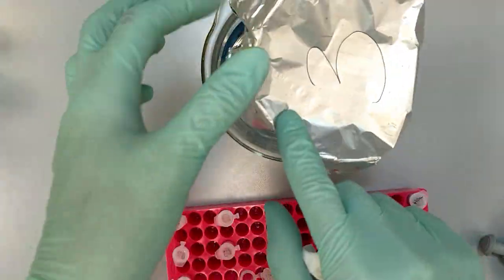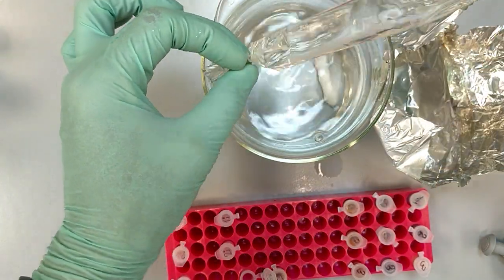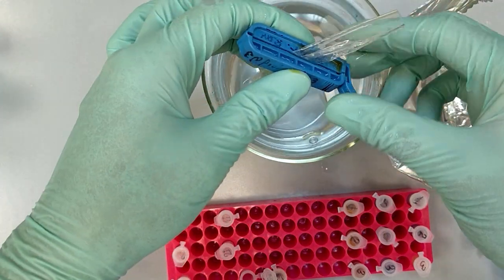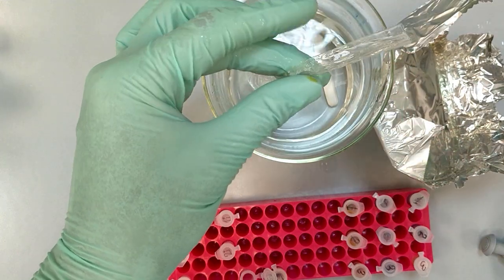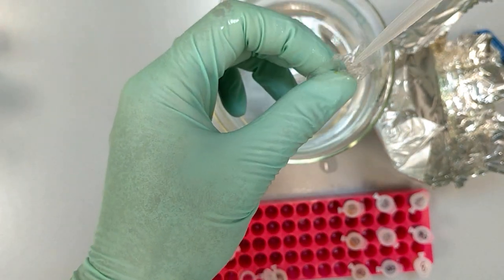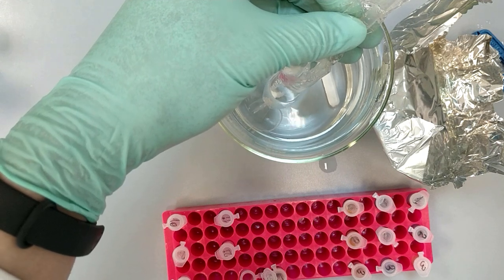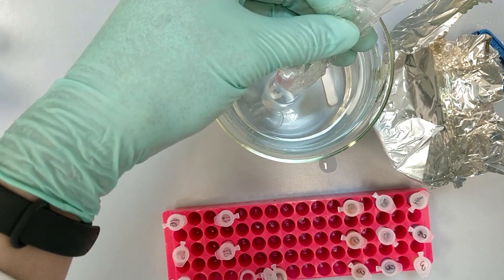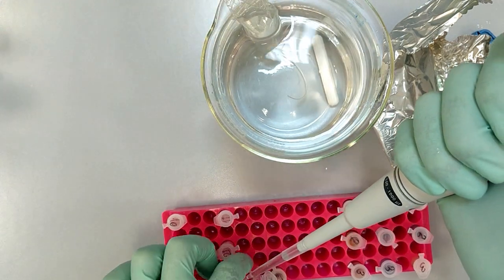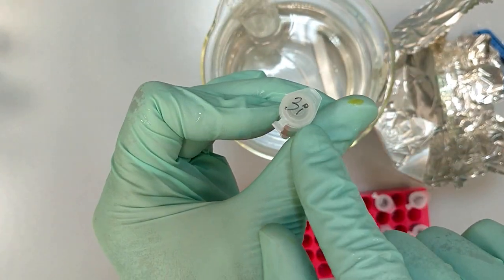Finally, we have the third secret solution, and as you can see, in terms of increasing volume, it is the most increased one. So you can go back in the video and see the initial volumes. So we perform the same type of actions. So we take 1 milliliter of this solution, and I do mix it before I collect it. So this is 3 inside.